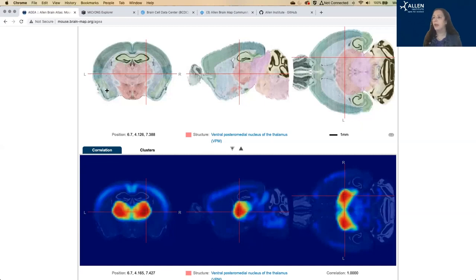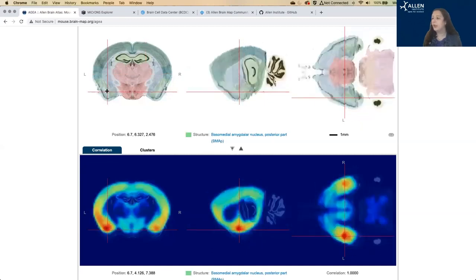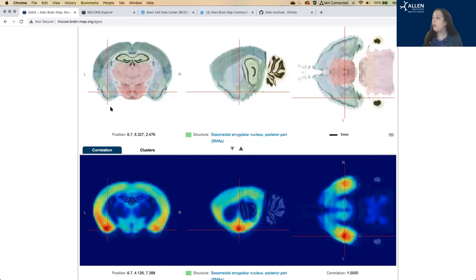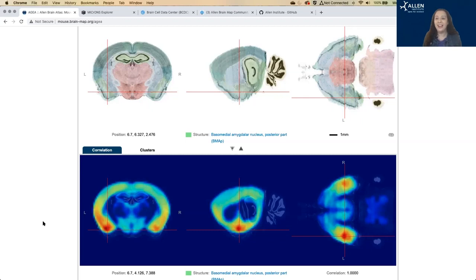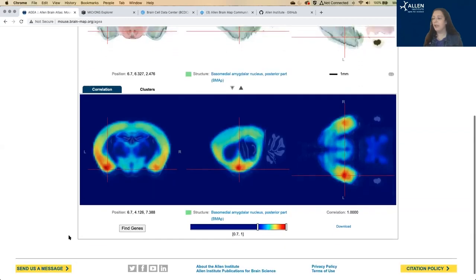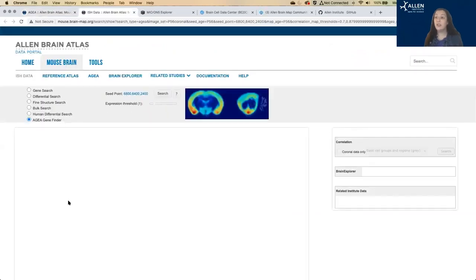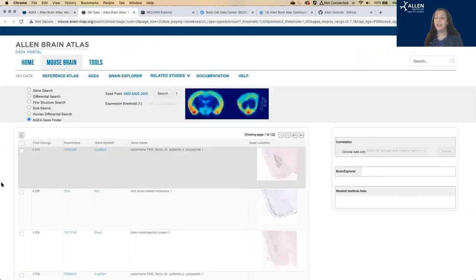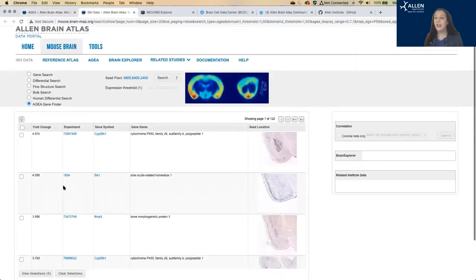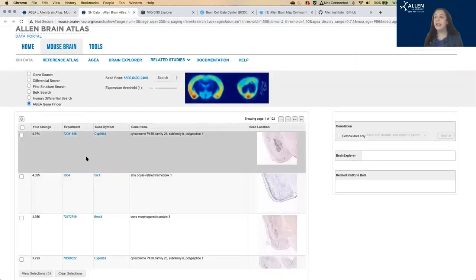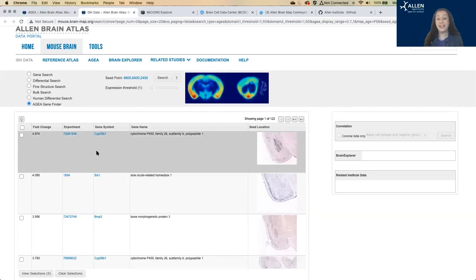So I'm going to pick another random region. You can see that for the amygdala, these are the brain regions that are highly correlated with the amygdala as far as the gene expression patterns. And then down at the bottom here, we have this find genes button. And that is going to pull up a list of those genes that are highly expressed in your seed region that you selected on that heat map.